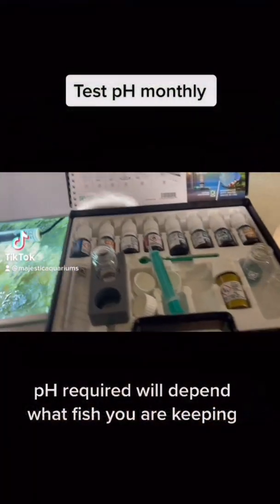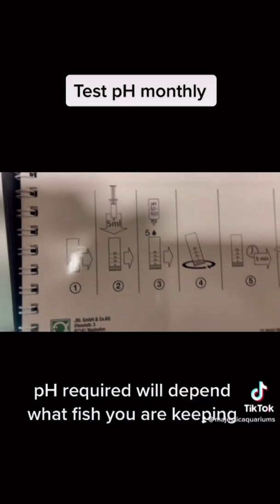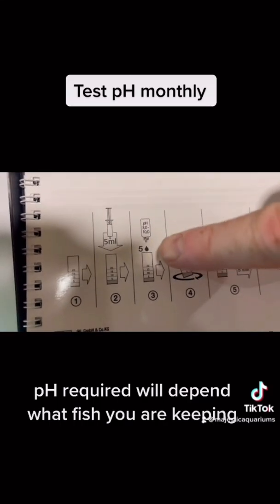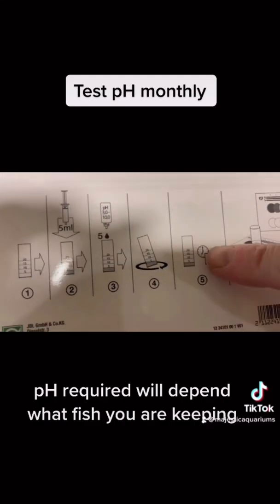Checking your pH is really simple. What we're going to do is put 5 mils of water into a test tube. Then we're going to add 5 drops of the pH solution. Then we're going to shake it. Then we're going to wait 5 minutes, and then we're going to look at the color.